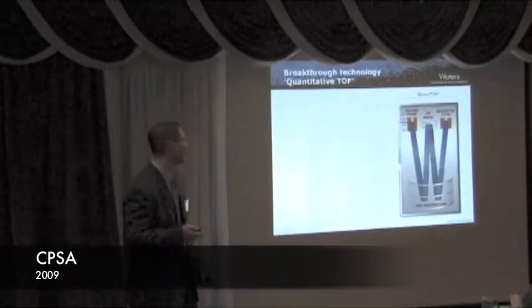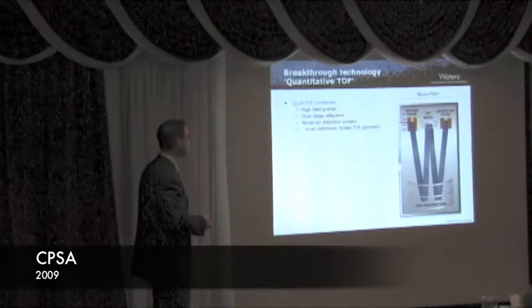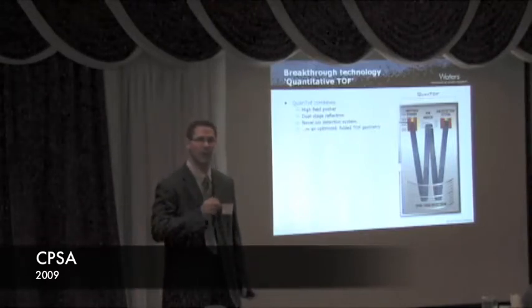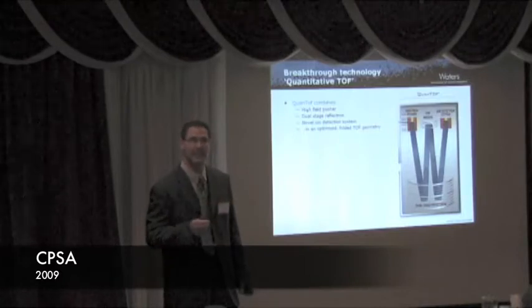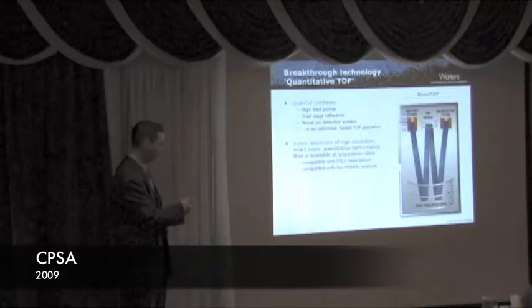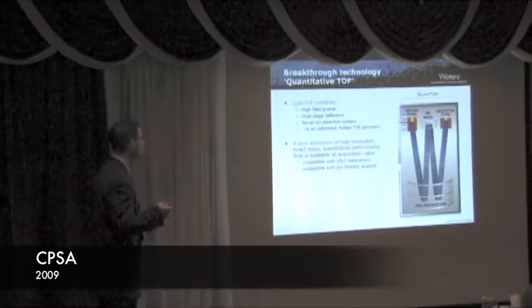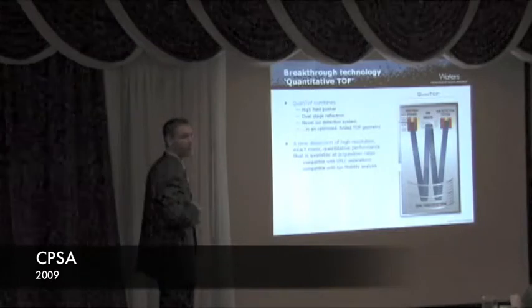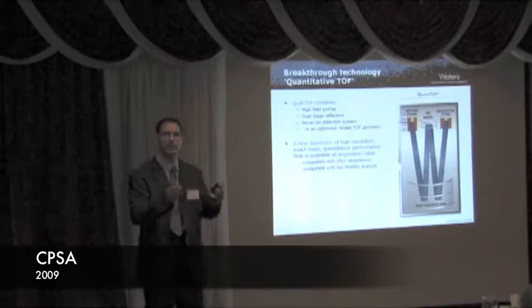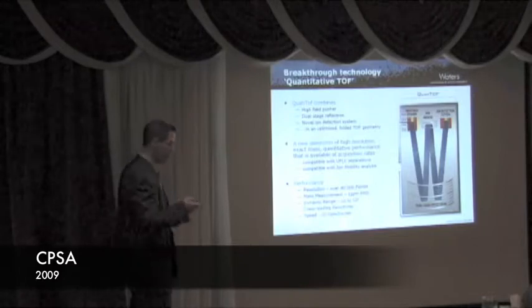So what have we done in this iteration of the instrument? Well, we redesigned the whole TOF analyzer, from the pusher to the reflectron and to a novel detection system. It's a hybrid analyzer which gives you the best of both worlds: the low ion detection of a TDC and the dynamic range of an ADC. The other thing we can do is, while this analyzer acquires at a rate of microseconds, we're able to couple UPLC separations on the order of 1 to 3 seconds with millisecond ion mobility experiments. So we can do LC, ion mobility, and MS all in the same run with excellent capability.